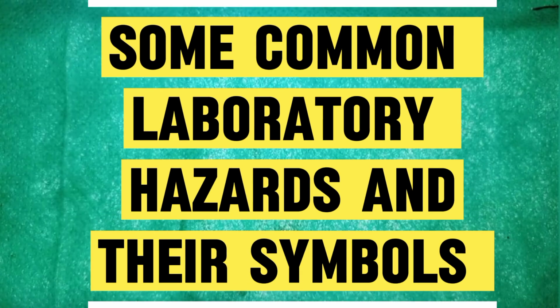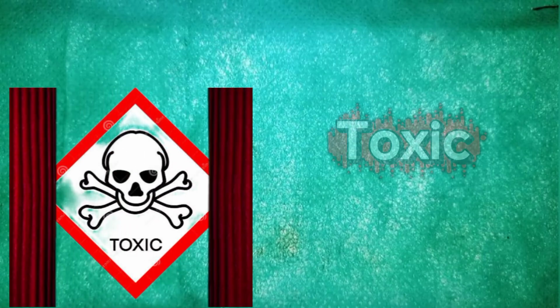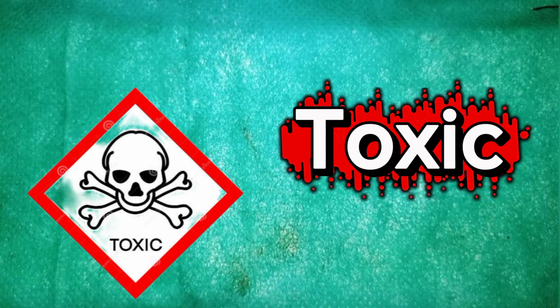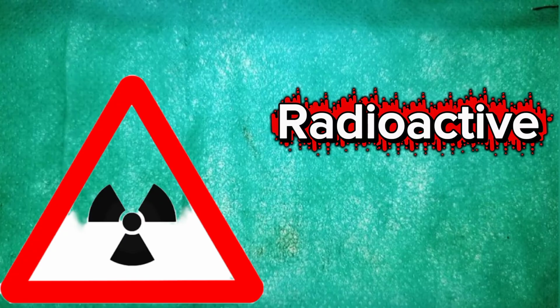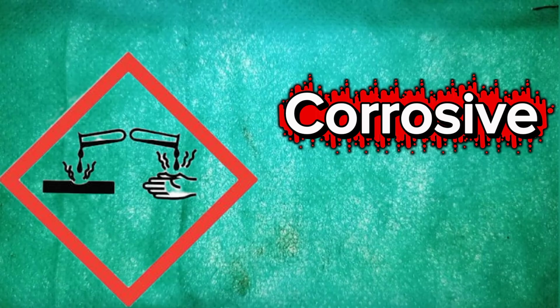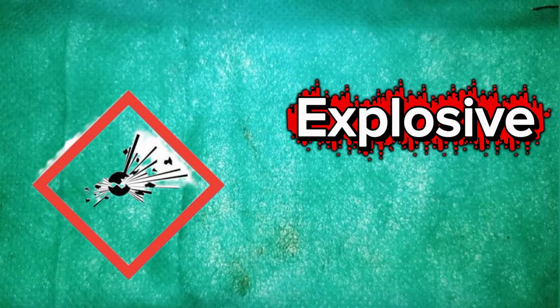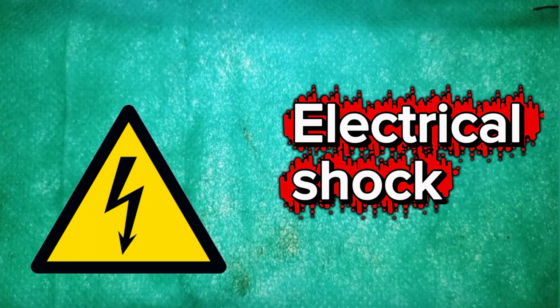Symbols of those common laboratory hazards. We have some common symbols, and these are the symbols that represent those hazards: flammable, toxic, radioactive, oxidizing, corrosive, carcinogenic, explosive, electric shock, and among others.